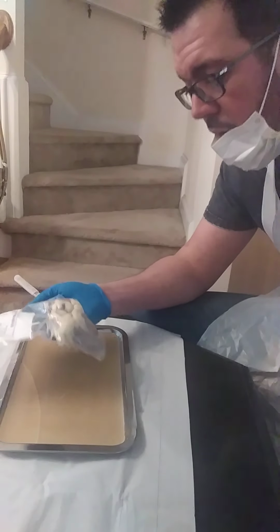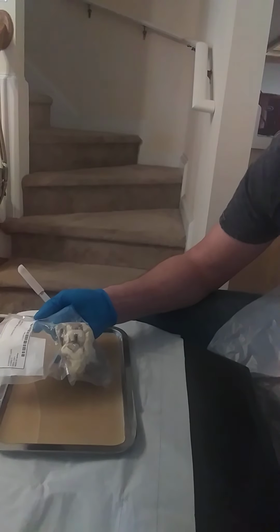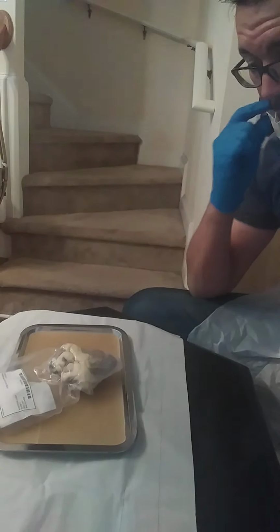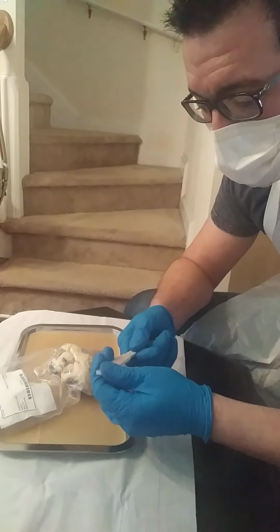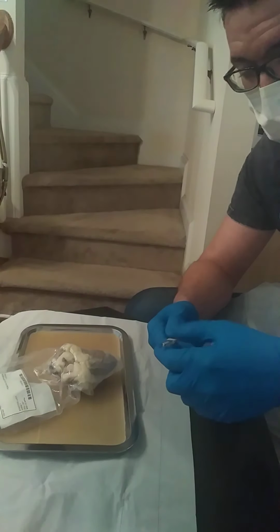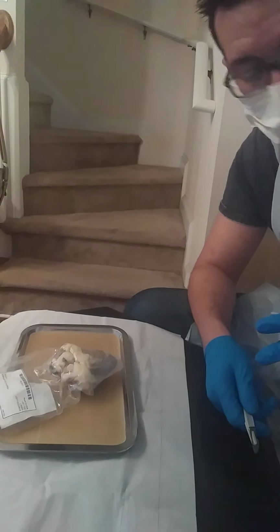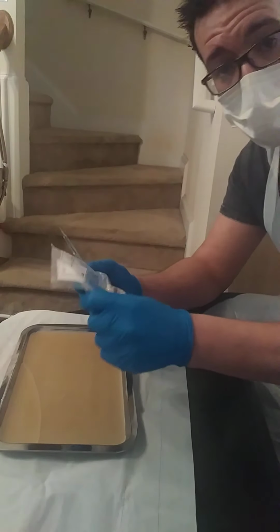Sheep heart dissection. And I'm here to identify a couple of parts. Just a few, you know. Alright, without further ado, let's get started. I'm assuming that you just want us to use this lab to identify the parts that are in the list. And I'll be following the procedures slightly, because there's no mention about what you want us to do with the balloons and the bottle and all that stuff. So, let's get started.